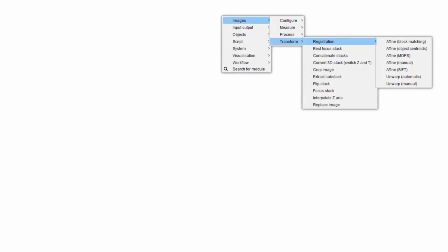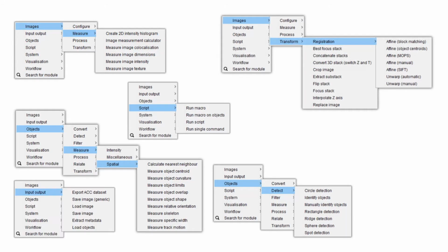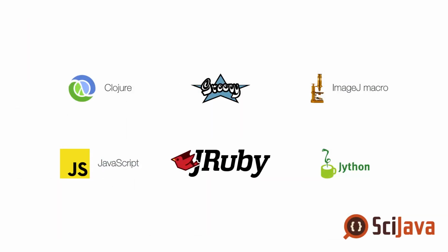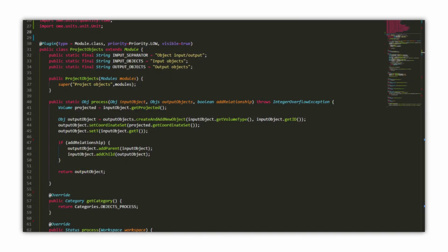Furthermore, MIA's functionality isn't limited to the 200 built-in modules. Integration with the SciJava scripting interface found in Fiji allows novel processing steps to be developed using a range of languages such as JavaScript, Python, and Groovy. It's also possible to develop entirely new modules by extending the core MIA framework, with existing MIA extensions providing video loading and compatibility with deep learning tools such as Stardist.